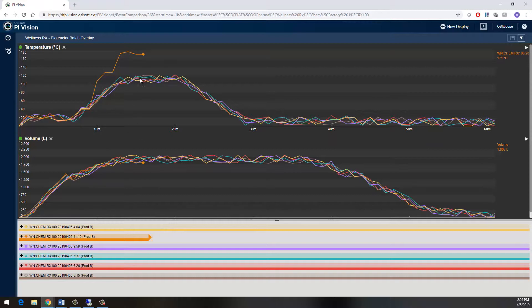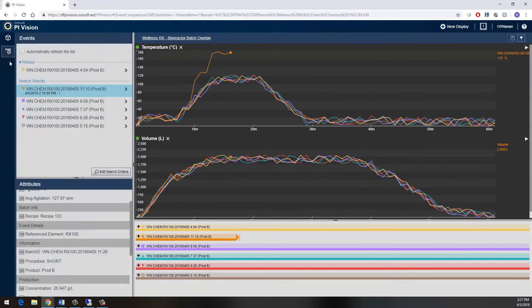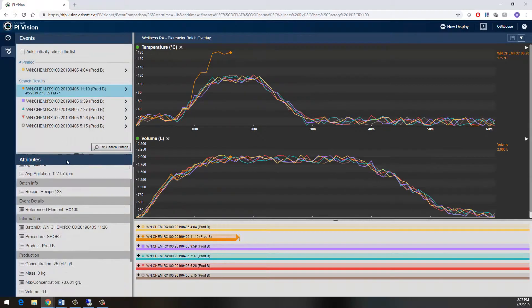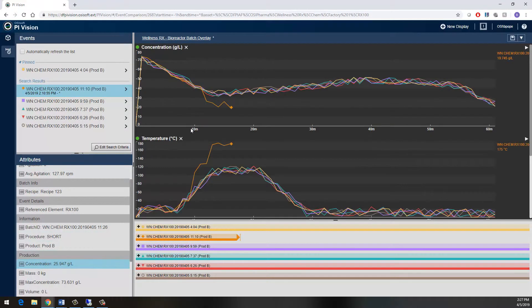You can clearly see my temperature profile is outside of spec, but I'm not sure at this point if this is something like a bad sensor or something that's actually impacting my process. It looks like my volume trend is normal. You can also come in and pull in some other process parameters from my event frames, such as my concentration to check the titer of my product.